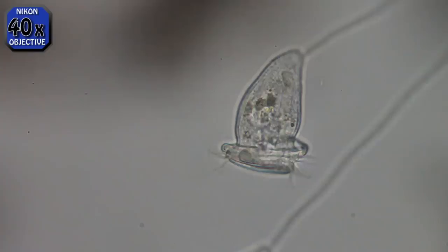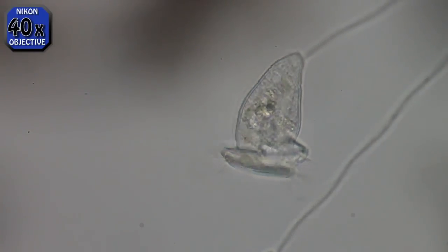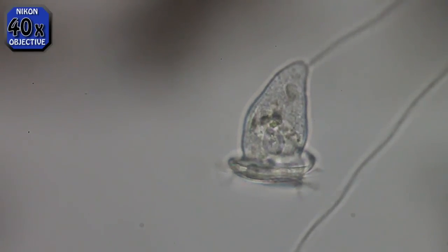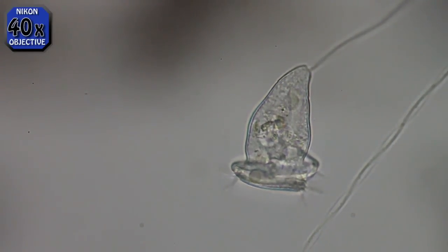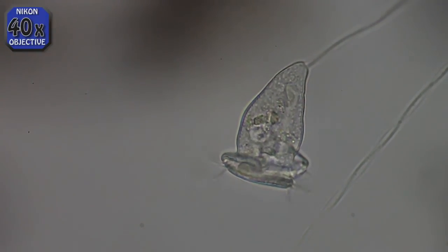And there's another one. Let's see the ring around the opening — it looks like a screw thread, it looks like a coil. And that's about the end of that.